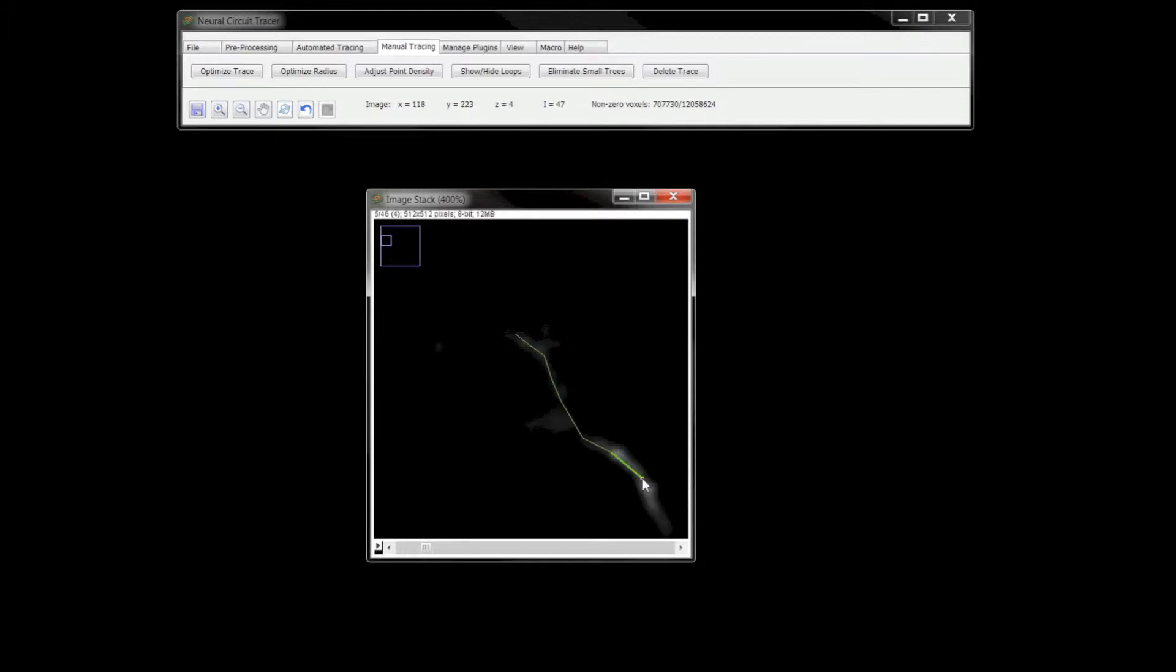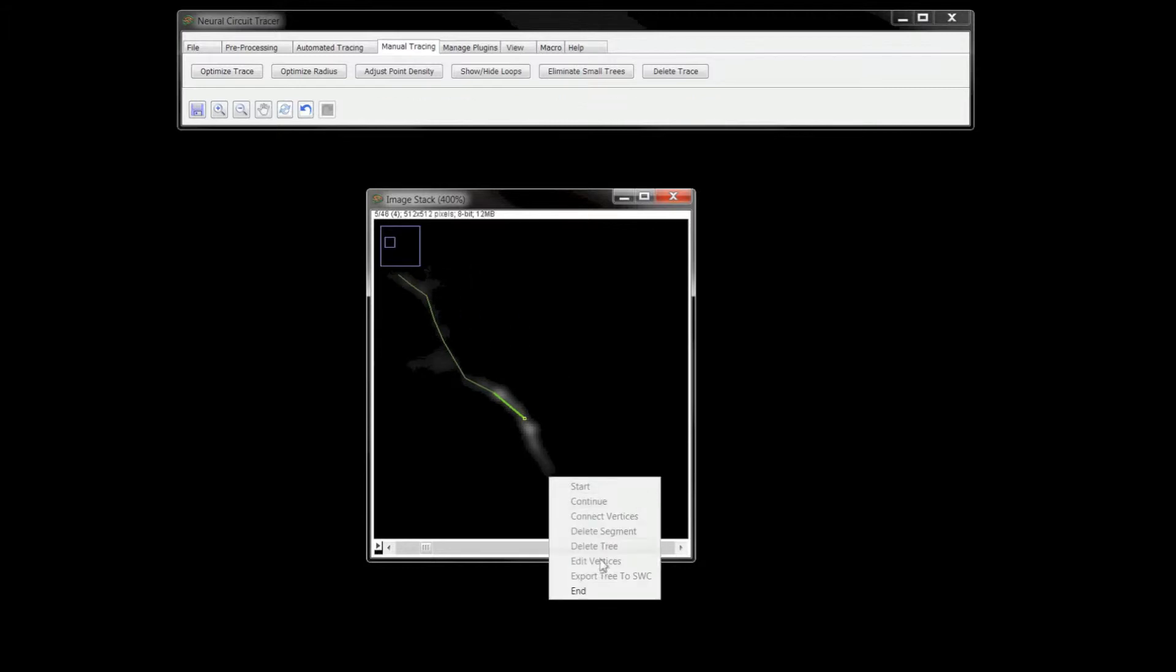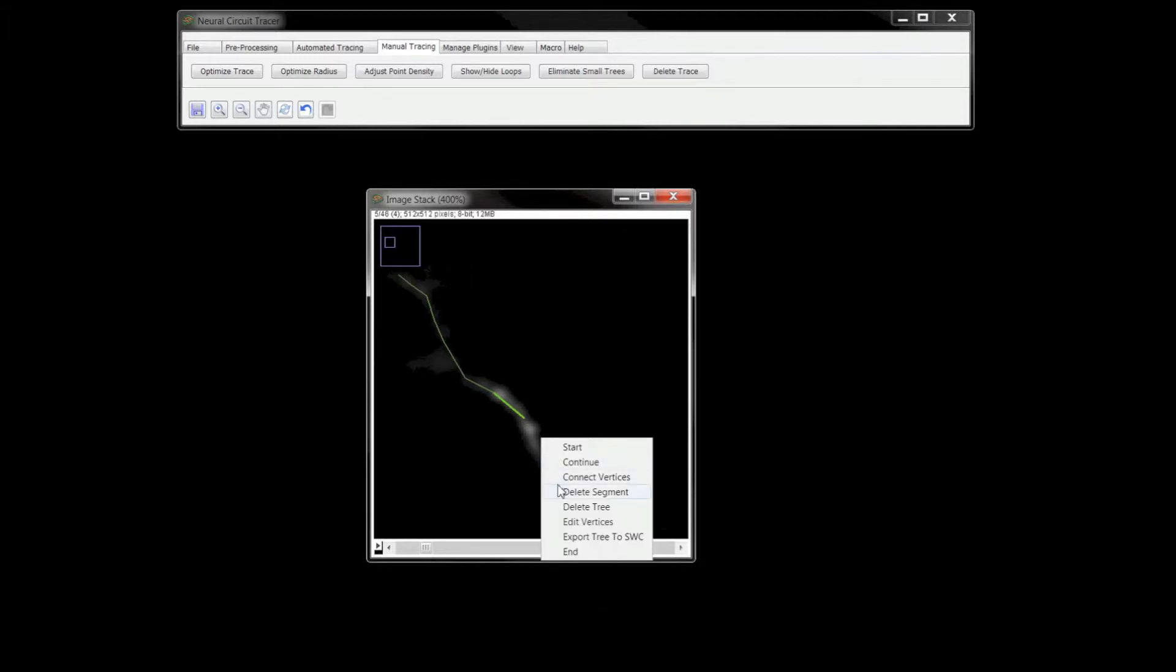I can work on disconnected parts and connect them later, as well as edit existing vertices in the trace.